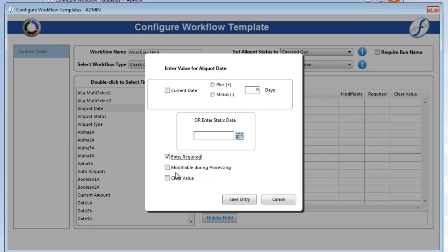Take special note of the Modifiable During Processing checkbox, as you will see it frequently during the workflow configuration. In this case, it means the user processing the workflow has the ability to modify this field's data. This is necessary if you selected Entry Required and will not be entering data here.